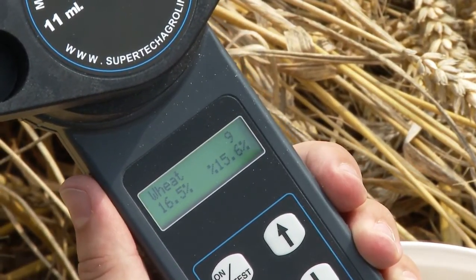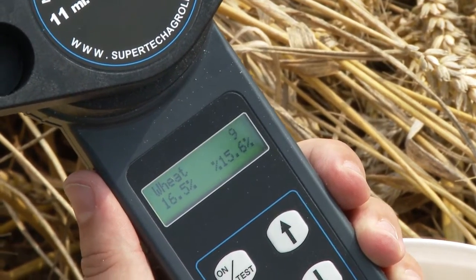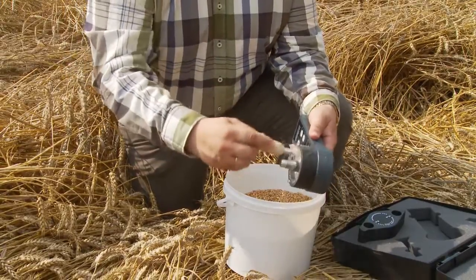At the same time you get an average value for the last four measurements done. Use the FarmPro for example in different parts of the field to determine when to begin harvesting.